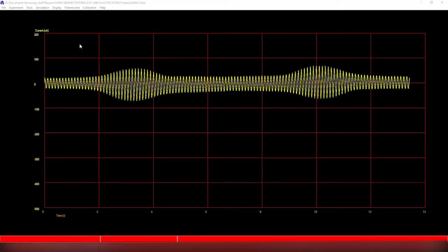In this program we use, there's a lot of capacitance fitting software, but anything really works as long as it's fit to a polynomial or a constant value. And if this isn't available to you, you can fit it as a constant quite easily in any of the optimization algorithms, as long as you have a reasonable starting point.